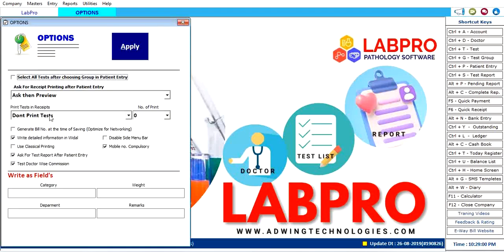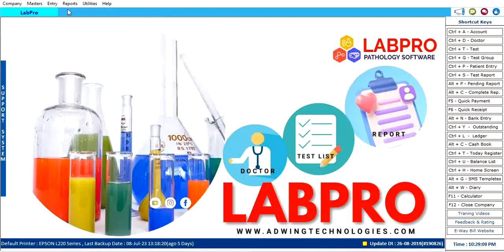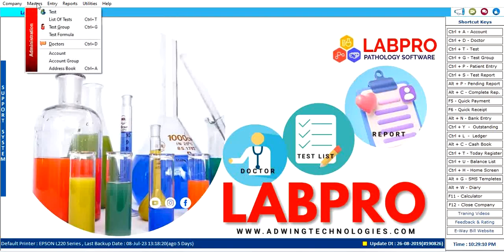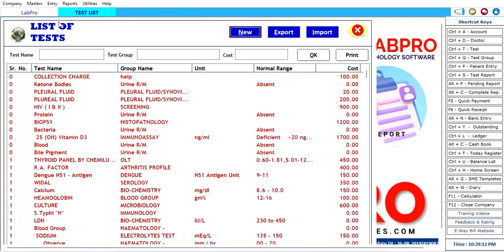You can also manage the test categories and settings. After that, you go to Masters. There are lists of tests you can search.